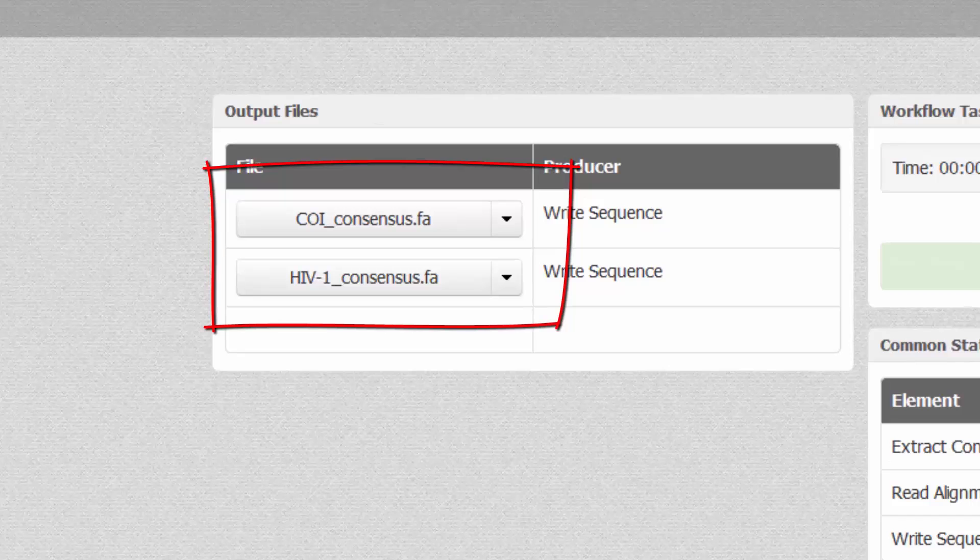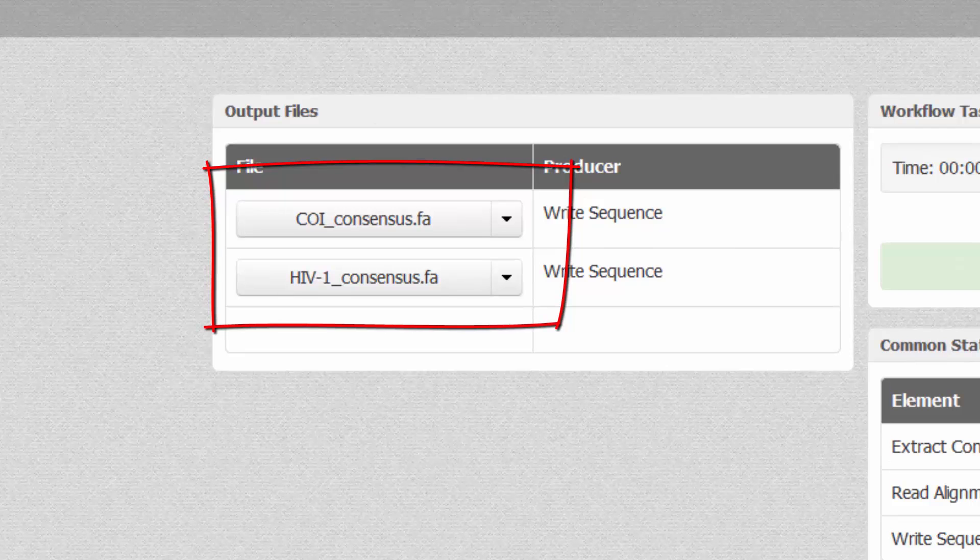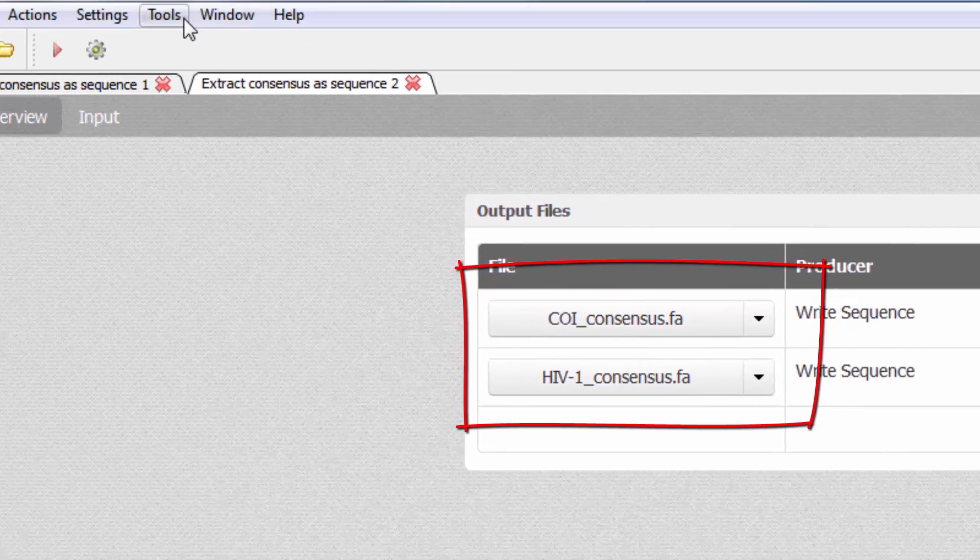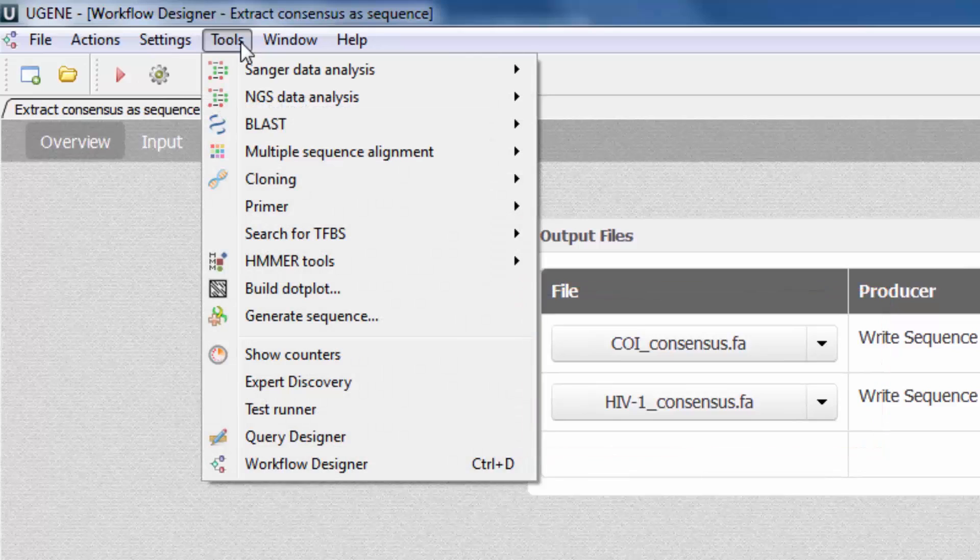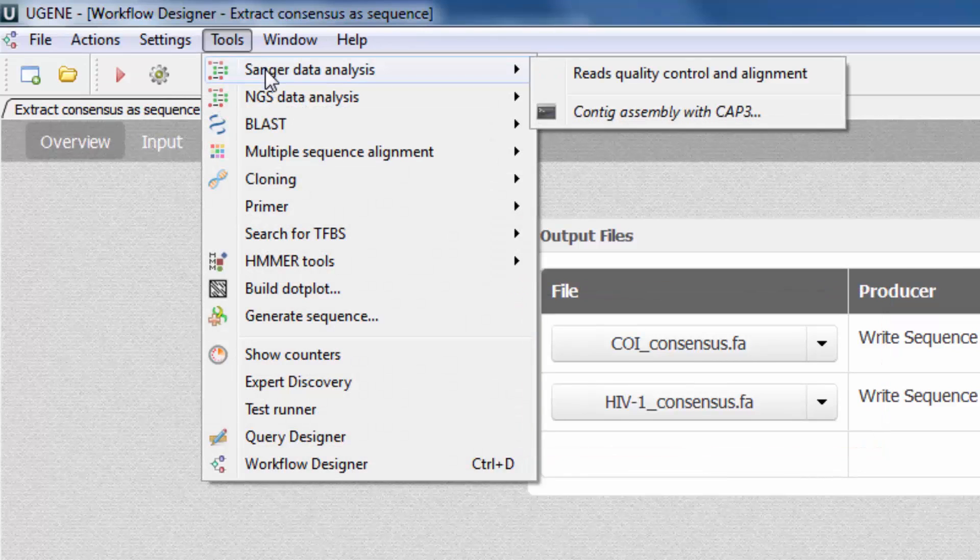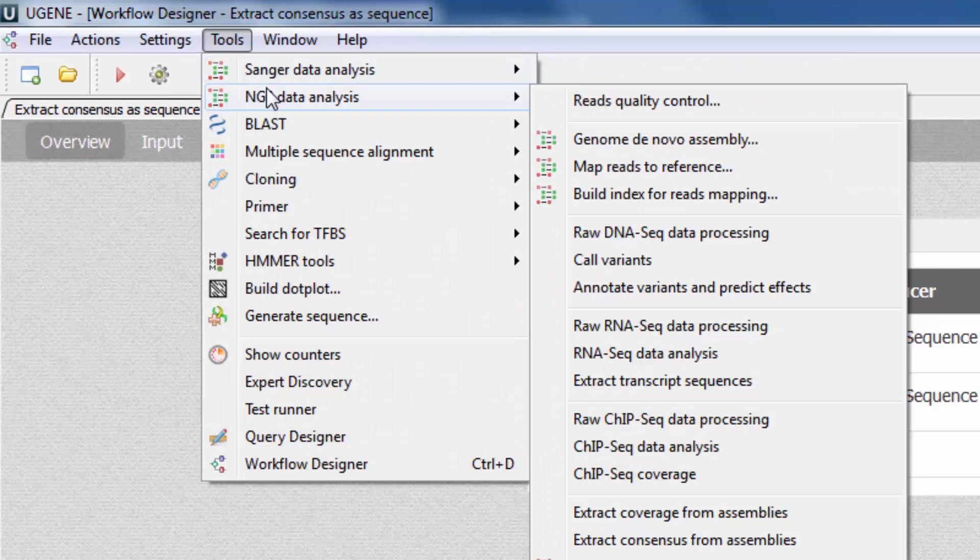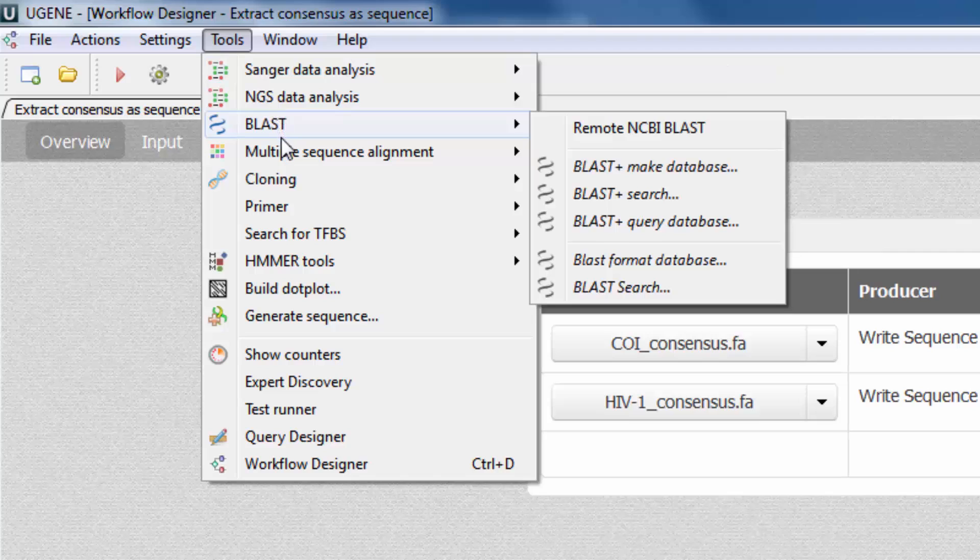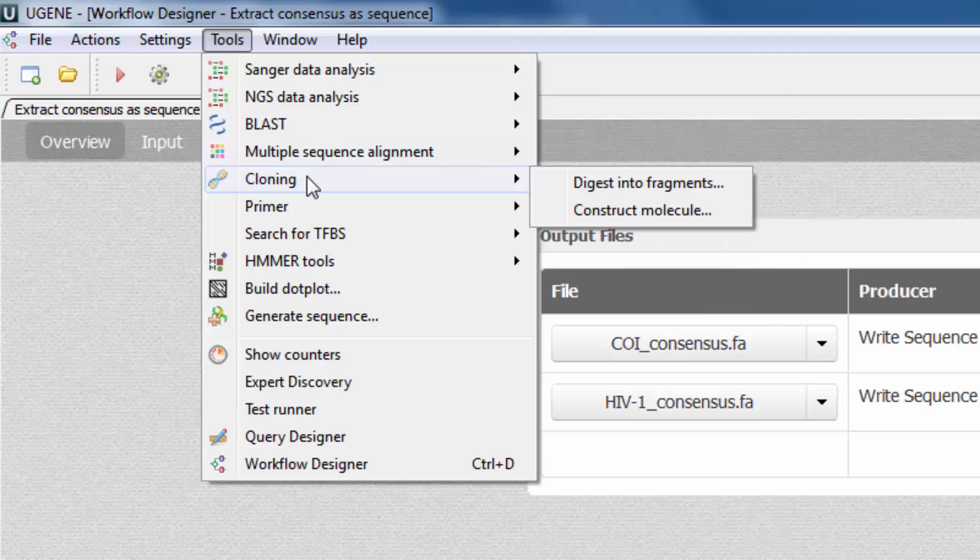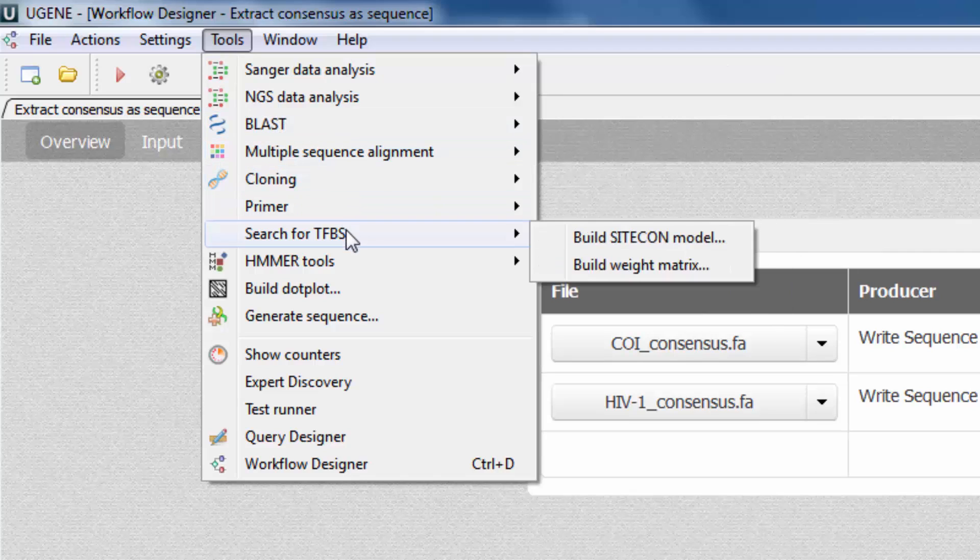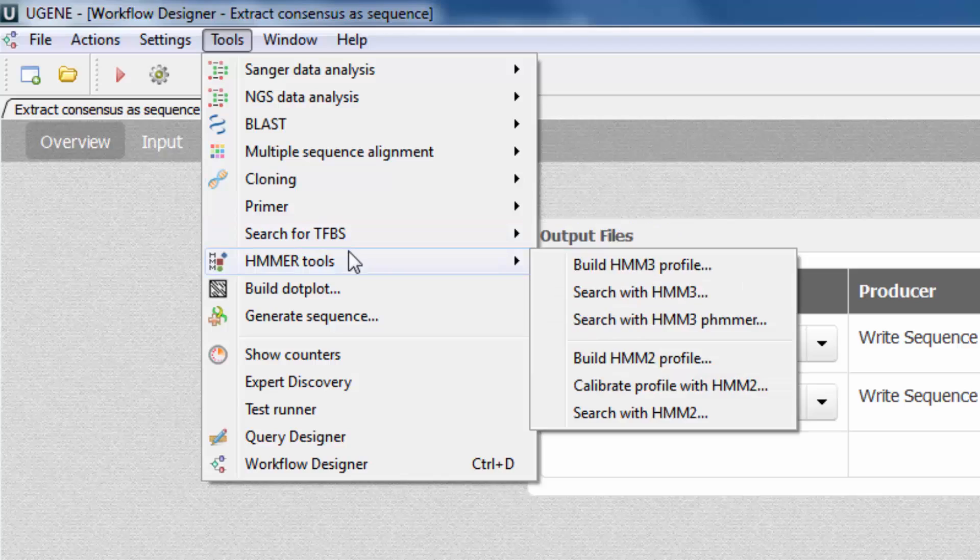Finally, there is one more usability improvement worth mentioning. The tool's main menu was reordered and majorly expanded. Some of the menu items now directly open the workflow designer with a workflow that solves the task.